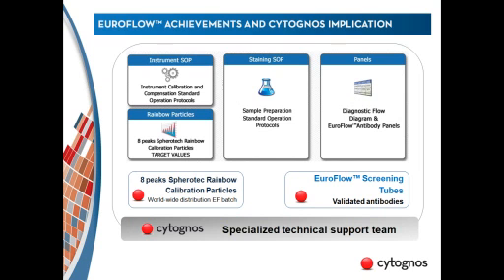So thanks to these protocols, if you are following them in the US and applying the same antibody panel, you are going to have the same results, completely comparable in terms of fluorescence intensity, in terms of pictures, with another lab that is in Europe, in Africa, in Australia. This is why the standardization of these protocols is so important.